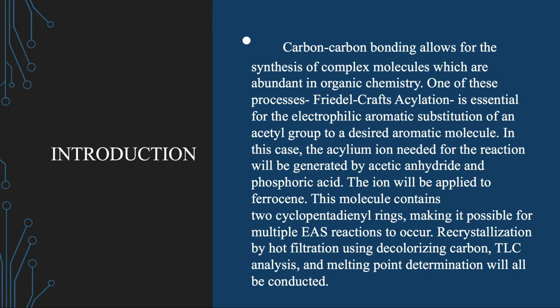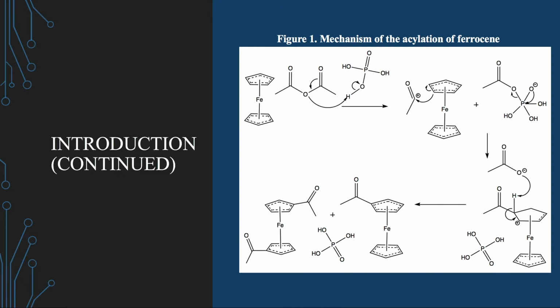This molecule contains two cyclopentadiene rings, which makes it possible for multiple substitutions within the EAS reactions to occur. Recrystallization by hot filtration using decolorizing carbon, TLC analysis, and melting point determination will all be conducted.